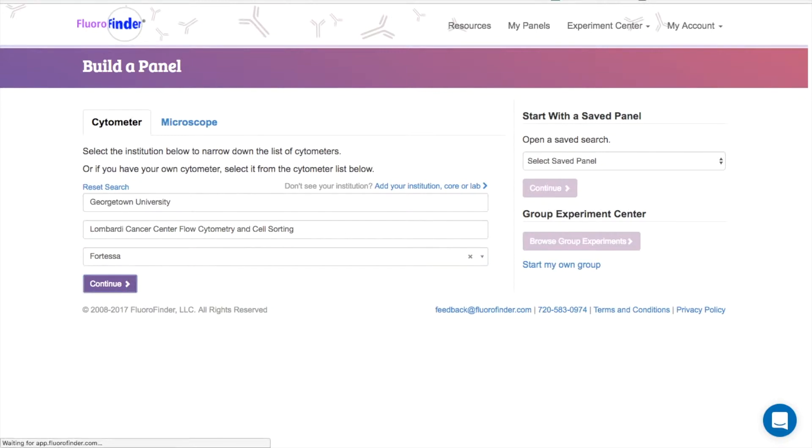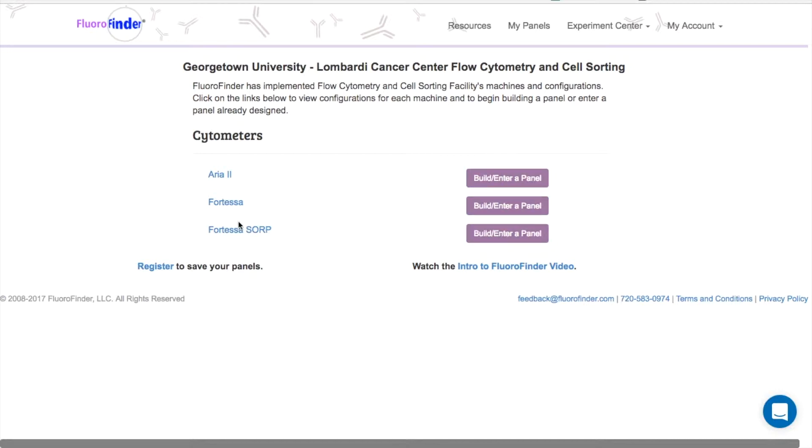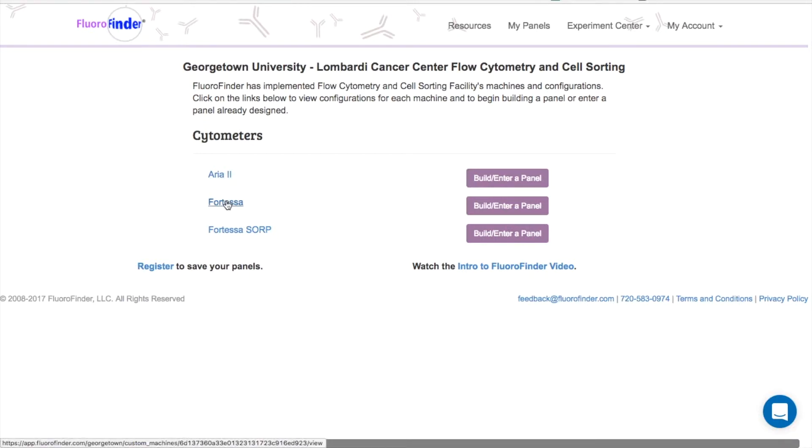Many facilities also have a custom Fluorofinder URL where you can immediately access your machines. If you have yours bookmarked, it will take you to a page that looks something like this. From here, you can navigate directly to the marker page using this button on the right, or if you want to access your machine configurations, you can do that using this link on the left.